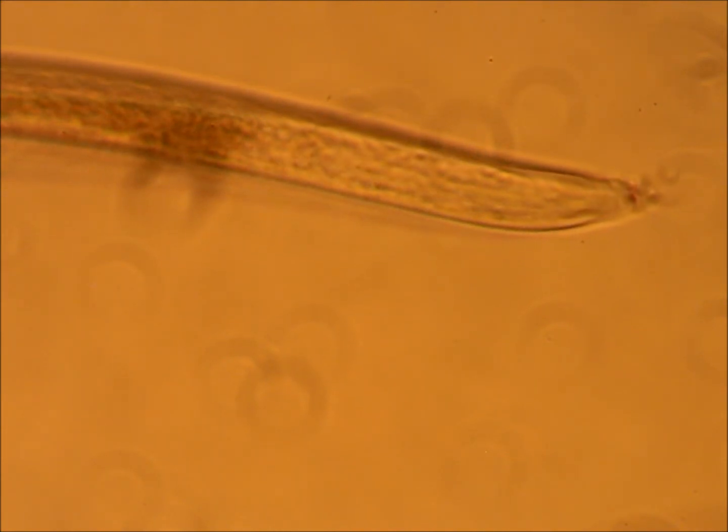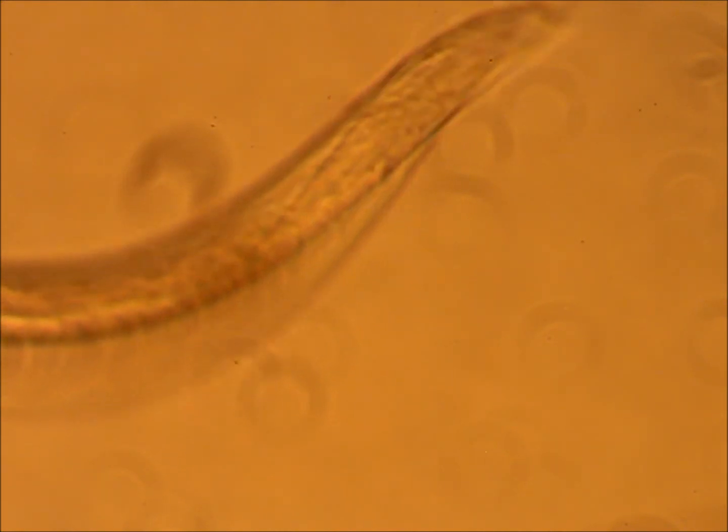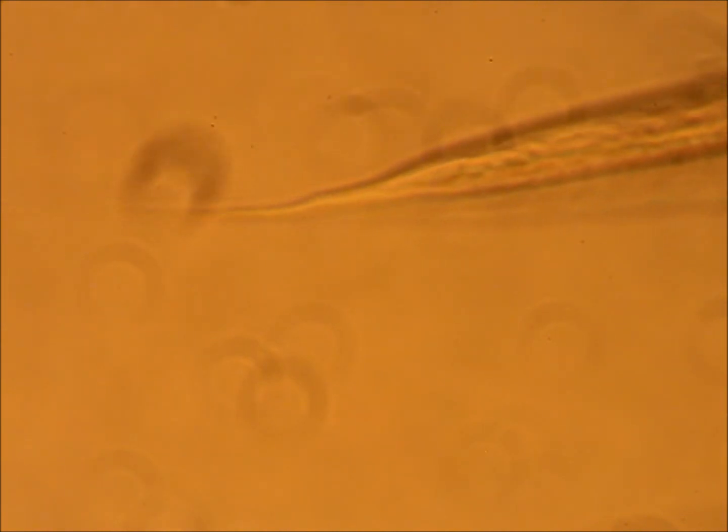Rose and her relatives are very common in aquatic environments and come in many different sizes. While Rose was certainly interesting, there was still a vast array of microorganisms in the first water sample to examine, so I wanted to see instead which microorganisms would survive in unfavorable conditions. So I obtained another water sample from a storm drain in the retention pond by my house in southwest Houston, where my mother always told me not to go near, and left it in my hot car for 3 days, capped with no access to outside oxygen.